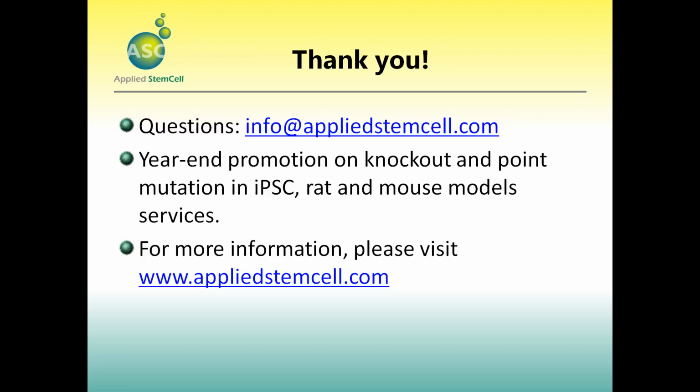Okay, the next question, what is the success rate of inserting a 6 kb fragment using CRISPR? 6 kb is pretty feasible using CRISPR with a drug selective marker on our hands. So the efficiency is about 60%.